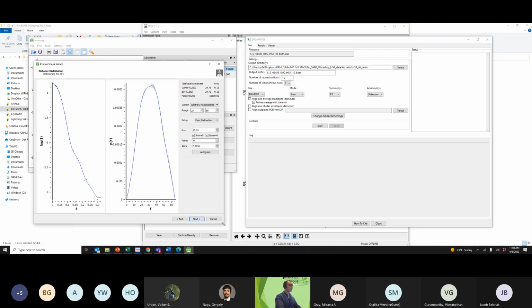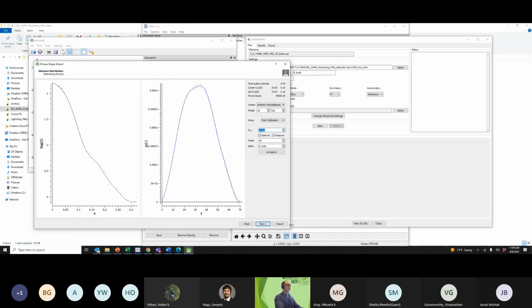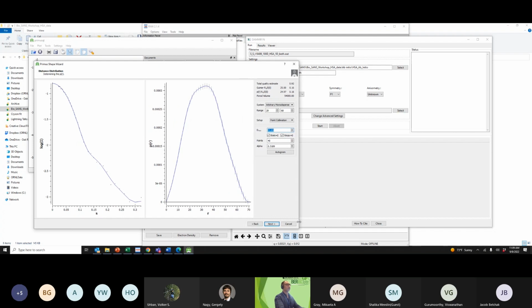Okay, let's get the P(r) here. That's not good. Go back. Okay, I'm not going to use all points in the low q. Let me see, yeah, definitely it is there. So I calculated my P(r) profile, and now I can go next.